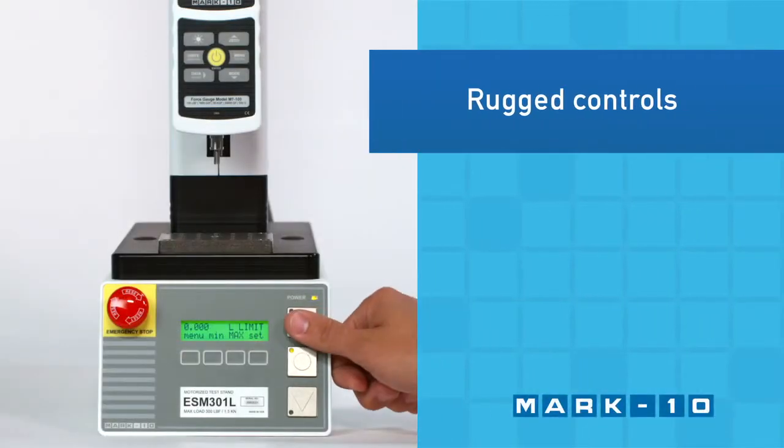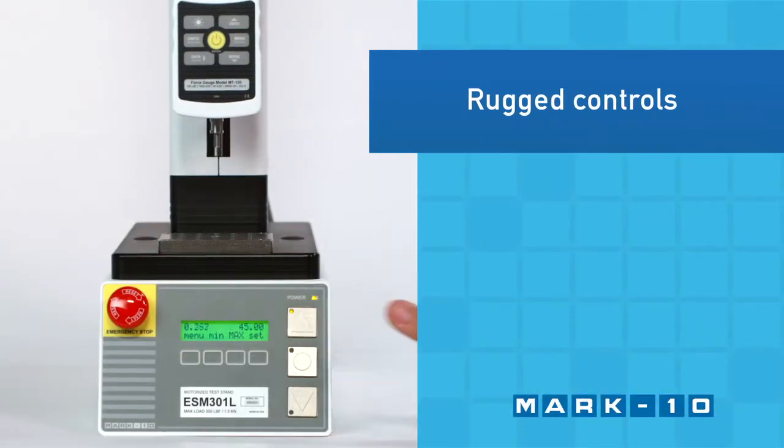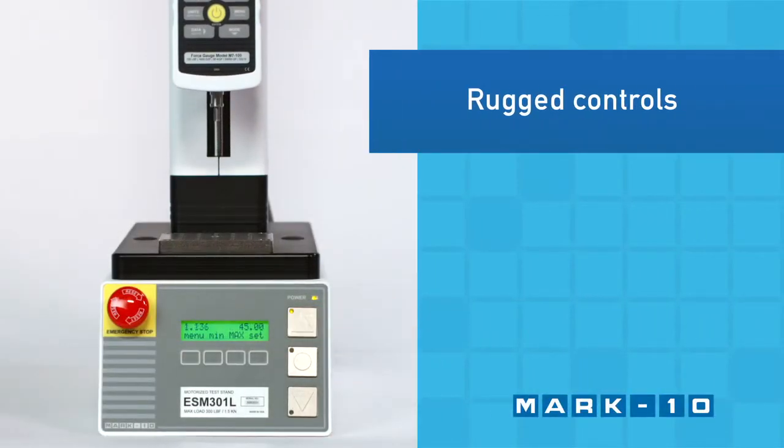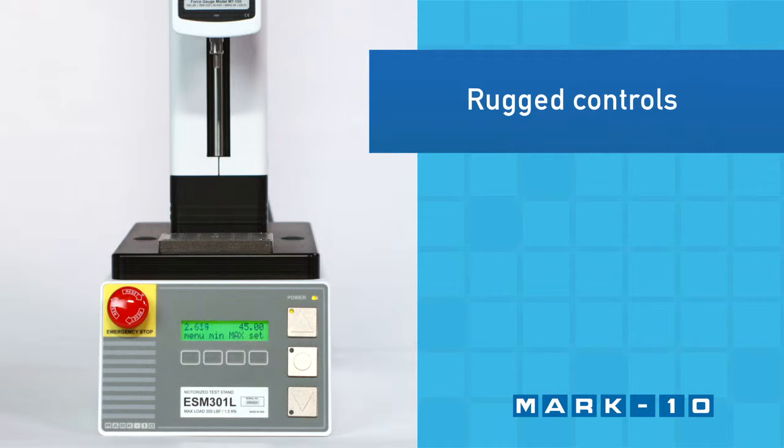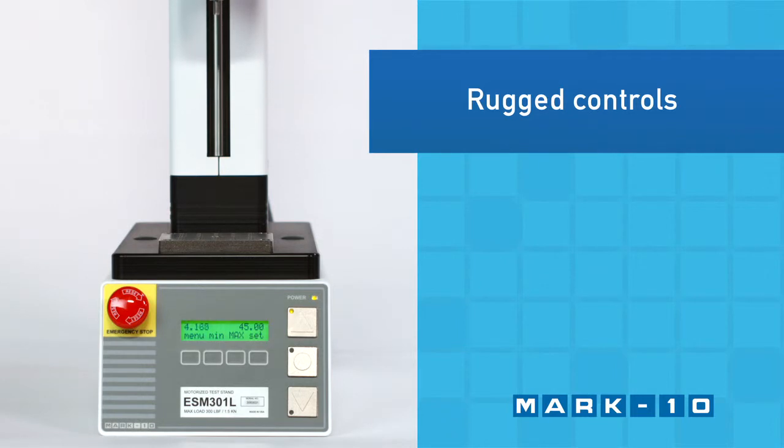Rugged aluminum up, down, and stop buttons are designed to withstand the rigors of daily use in industrial environments.